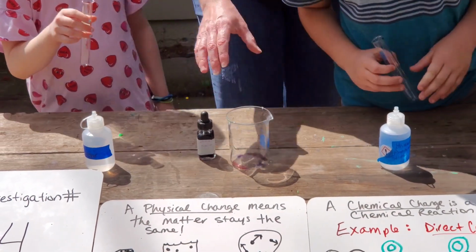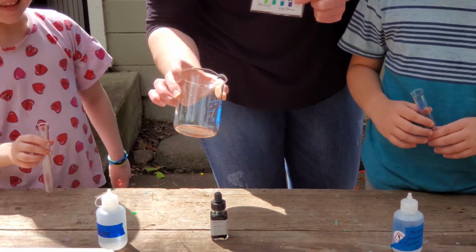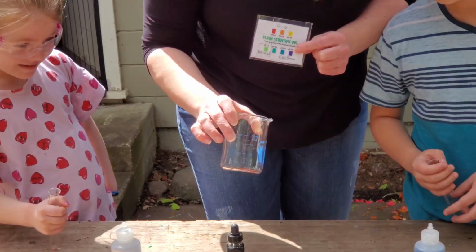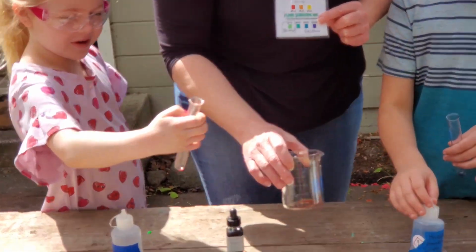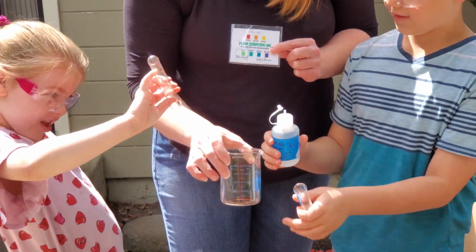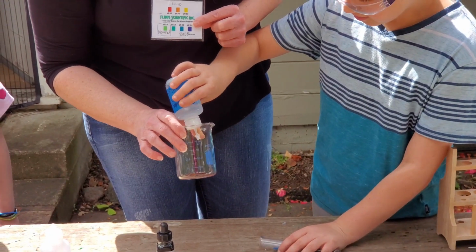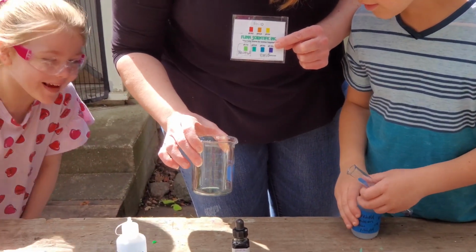Okay, so we're going to have to stir it up. Orange. Okay, I think we need a little bit more. It's still a little red. We were supposed to have an equal amount of each. Wait, Troy, can you put a little bit more ammonia in there and see what happens? Go ahead and put a couple more. We were supposed to have equal. Go ahead and stop. We're just supposed to have an equal amount.